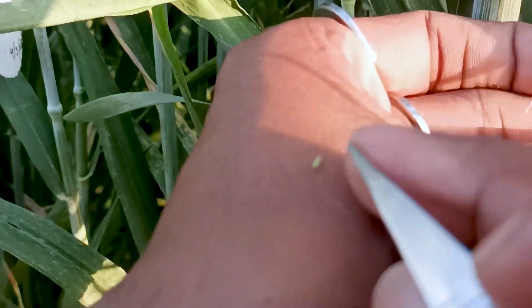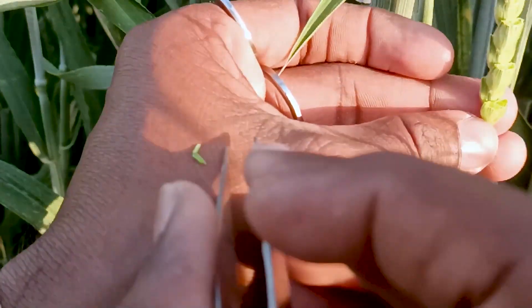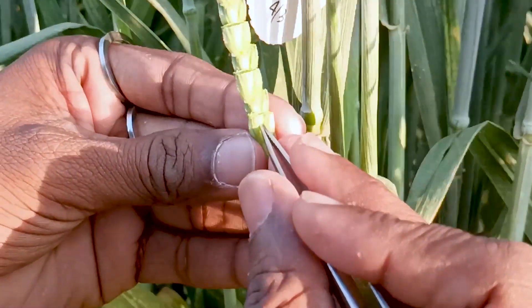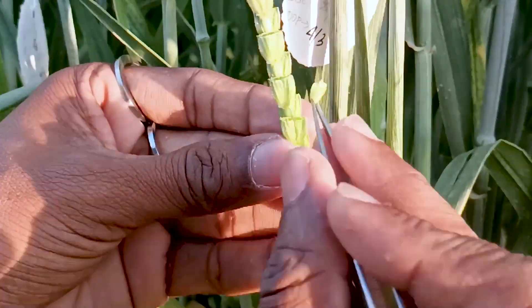There are three anthers. While doing emasculation we have to try not to damage the lemma and the palea, otherwise the seed setting will not be good. Like that only, we have to do emasculation on wheat in the whole spike.